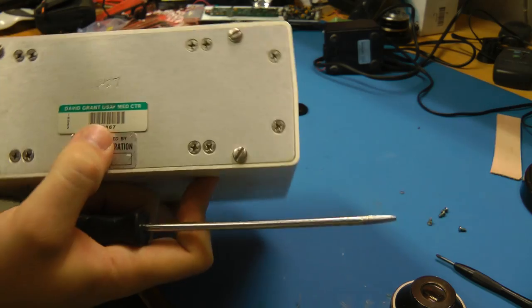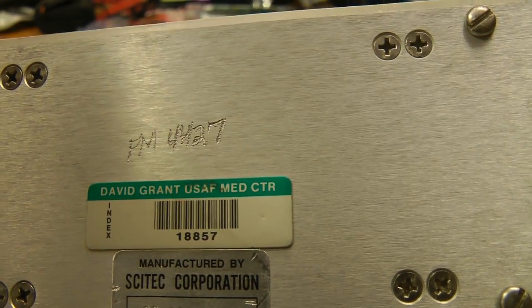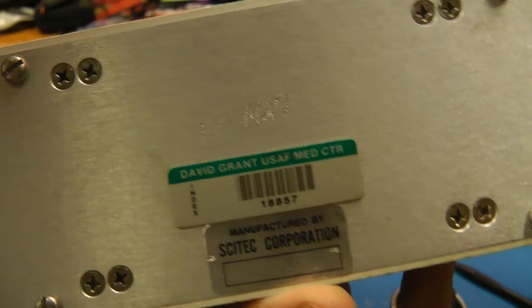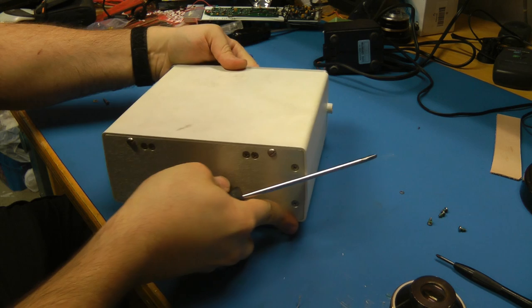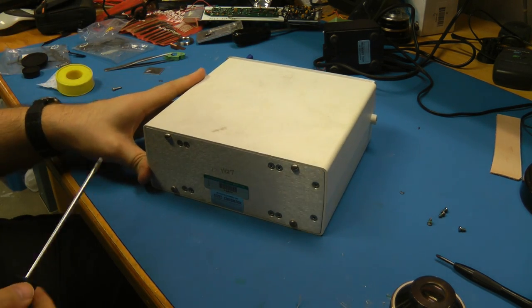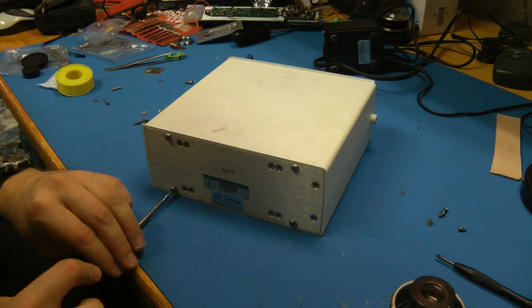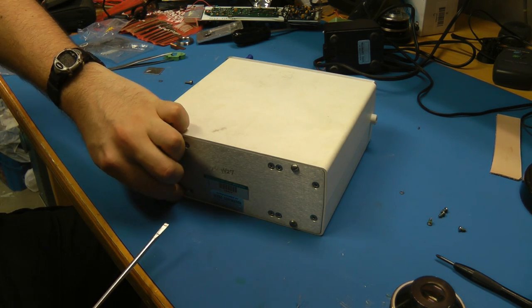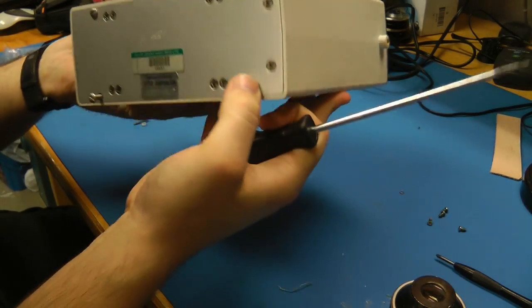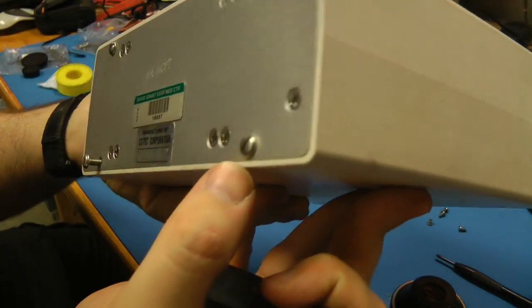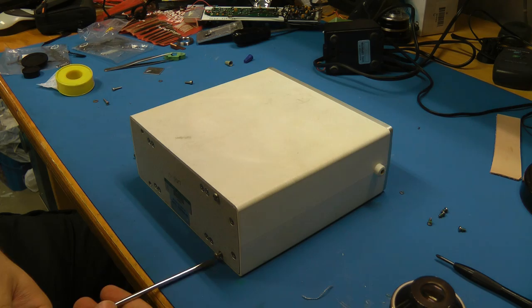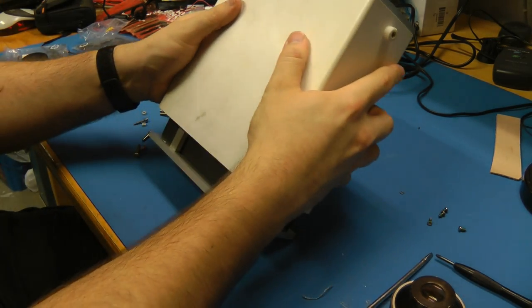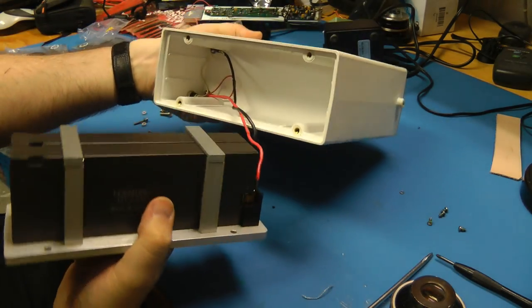So pulling this thing out of the case, you can see it has an asset tag from David Grant U.S. Air Force Medical Center. I'm curious what they were using that for. This is sort of for like lead paint detection and things like that. I wonder if they had it customized for some sort of medical application. Manufactured by SciTech Corporation. Let's see what's in this thing. It feels very very sturdy. Very heavy. The casing is made out of injection molded plastic of some sort. There we go. And oh, lead acid battery.